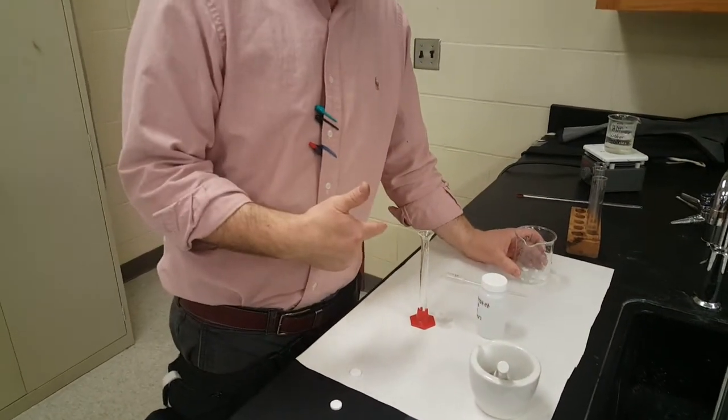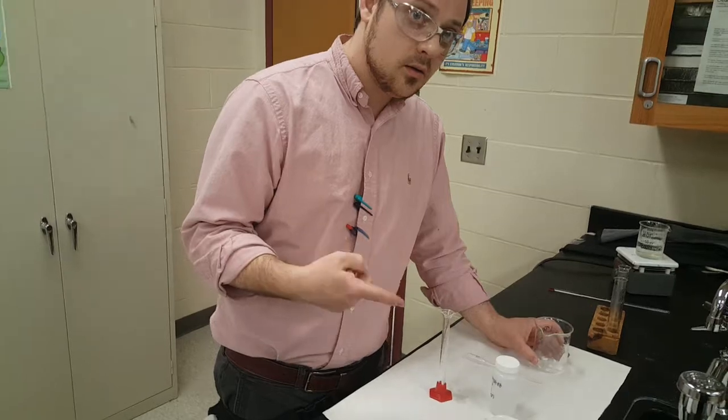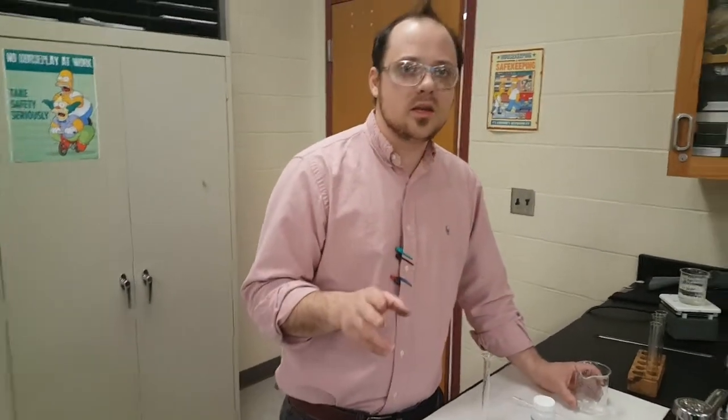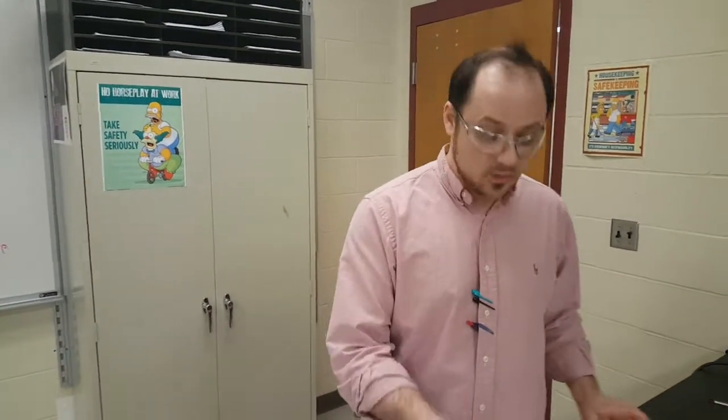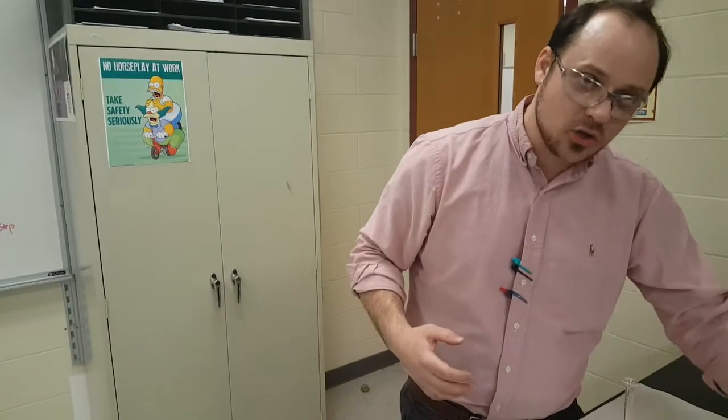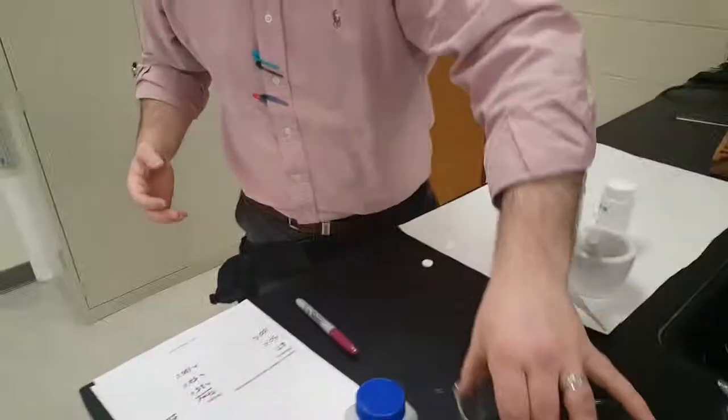How much acid are we going to add to this second trial? Well, we added 10 mils to the first trial, so we should double it, right? No, we want to keep it consistent because we need to control all the other things other than particle size. So I'm going to add 10 mils of the concentrated acid right on top. Count your Mississippis, use the timer, record in the data chart. I want to see particle size, whole tablet, chunks, powder, versus time it took for it to react. Is it fast, medium, or slow? Okay. Rinse down the drain, move your particle size stuff out.